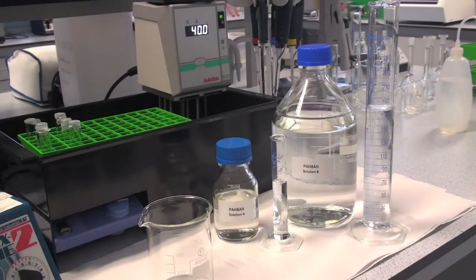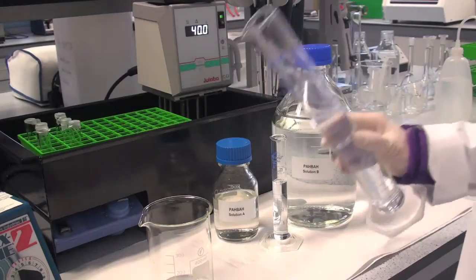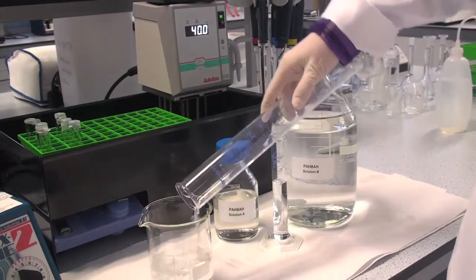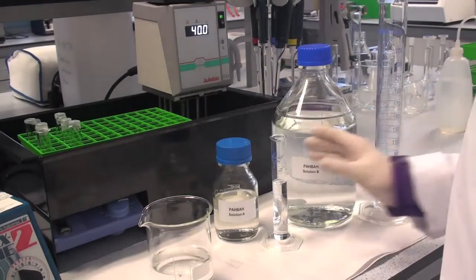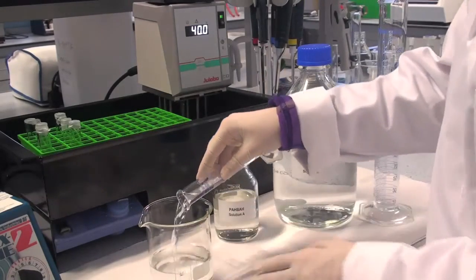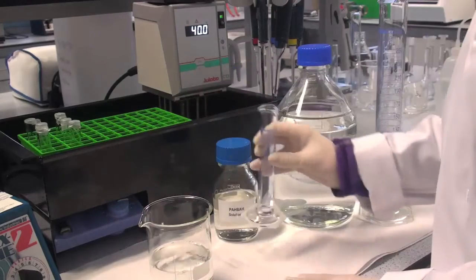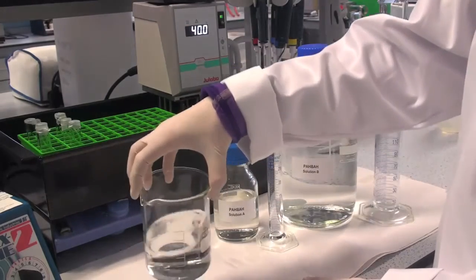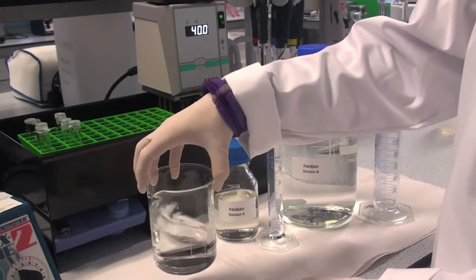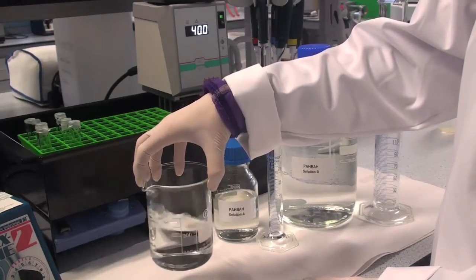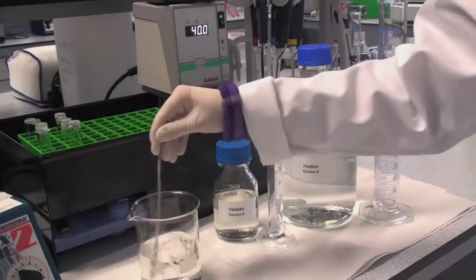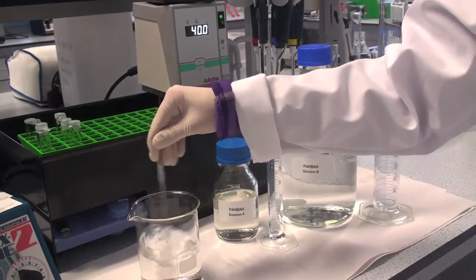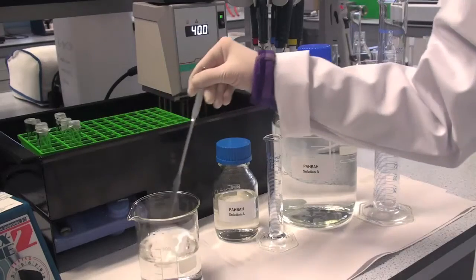Prepare PAHBAH working reagent immediately before use by adding 180 ml of PAHBAH solution B to a 300 ml beaker and then add 20 ml of PAHBAH solution A. Mix this solution thoroughly. This solution is stable for approximately 4 hours when stored on ice.